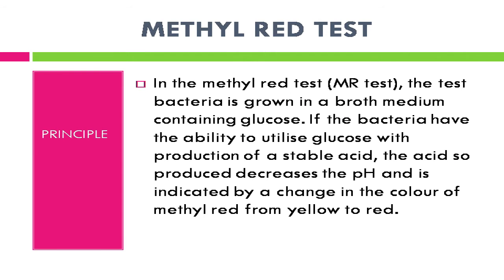Methyl red test. Some bacteria have the ability to utilize glucose and convert it to stable acids like lactic acid, acetic acid, and formic acid as the end product.